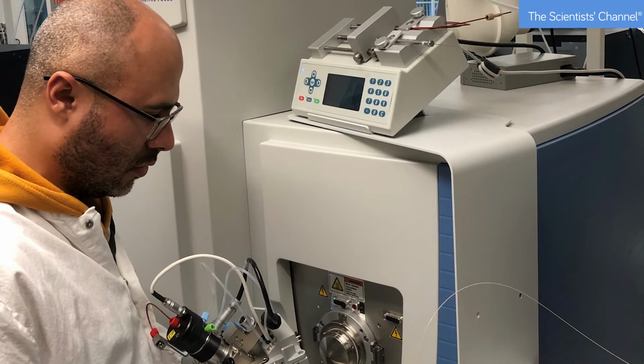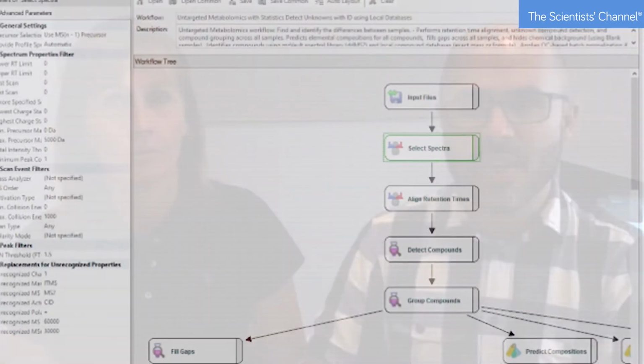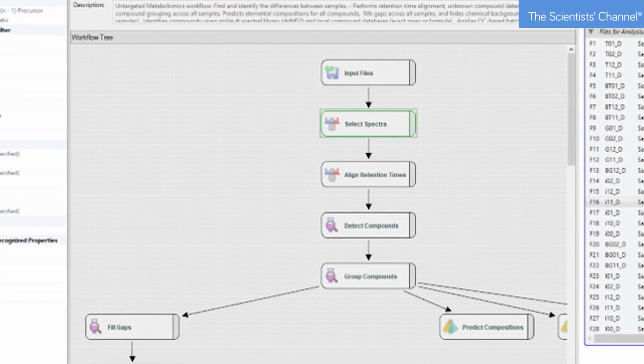Full scan has become quite popular because it's simple. It has been used in untargeted scopes based on the exact mass of a molecule. High-res enables us to get an idea of the identity of the components of an extract with a particular extraction method. The other asset of our hybrid platform is that it not only enables high resolution for isotope pattern matching, but also obtains MSMS spectra, which are used to fulfill the classification system to confidently assign identity.